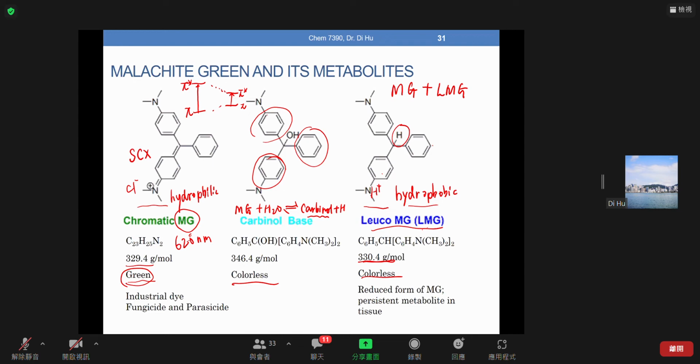And if you're using LC, which column can we use? Even though this one is like that one, we can still adjust pH. And because of the aromatic ring here, we can probably still use C18, right? When we are using UV-visible, and also UV and fluorescence, can we use LC-MS or LC tandem MS? Can we do that? Yes or no? Of course, yes, right? And if you are using LC-MS, if you're using ESI for ionization, now you can answer my question.